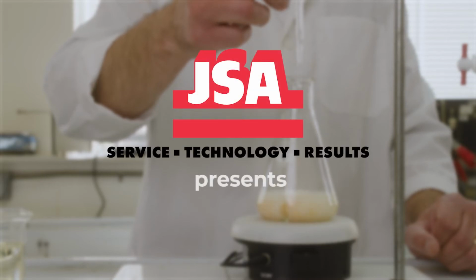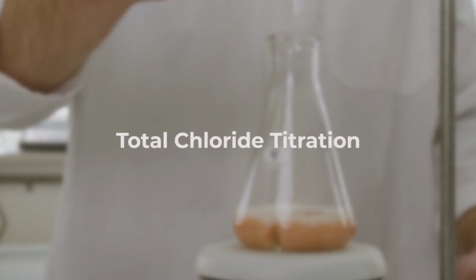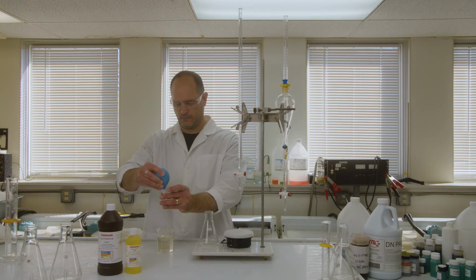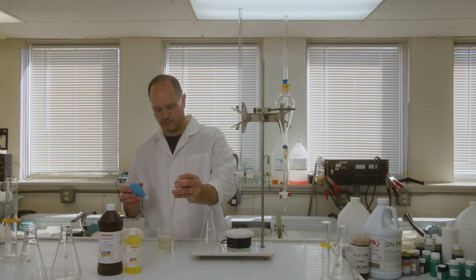Potassium and ammonium chloride salts help carry the current in acid chloride zinc plating solutions. If the total chloride concentration is not properly maintained, zinc coverage and thickness can be negatively affected, causing rejects. Frequent analysis is recommended using the following procedure.